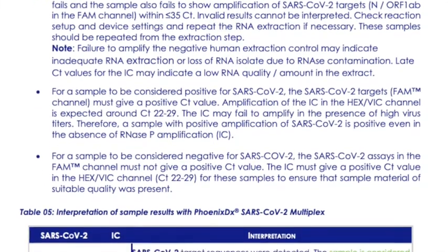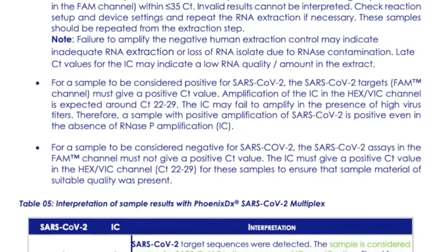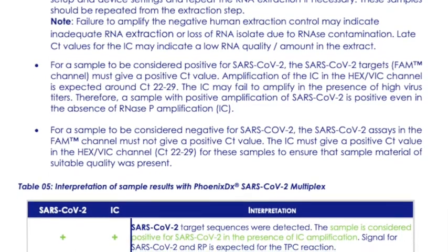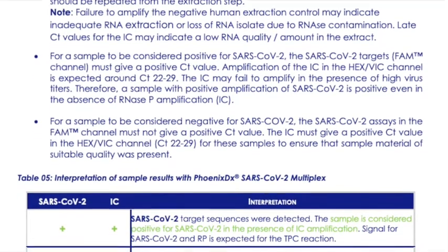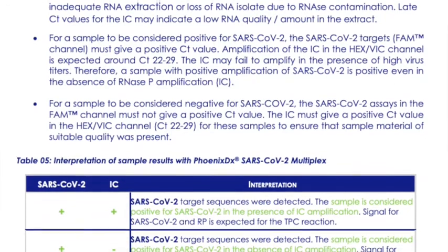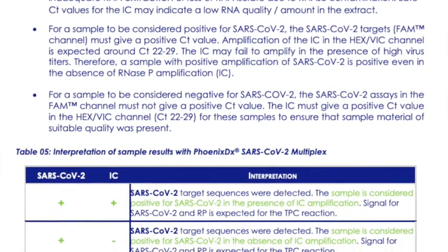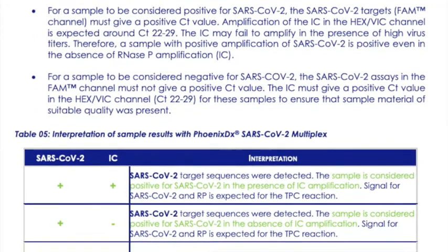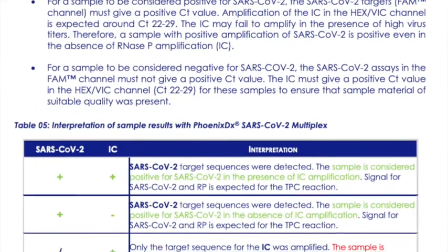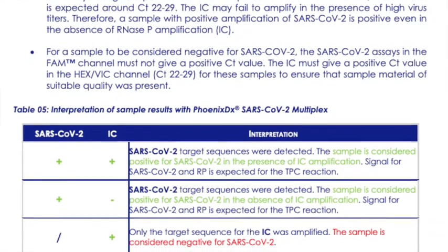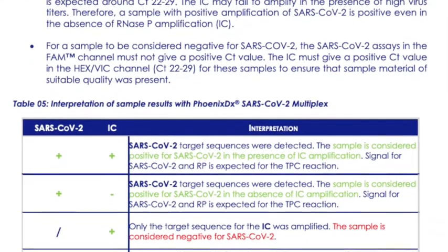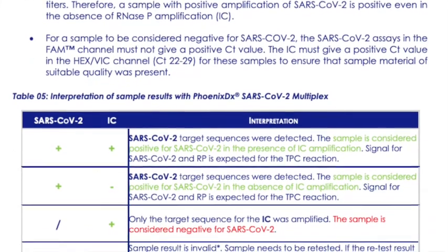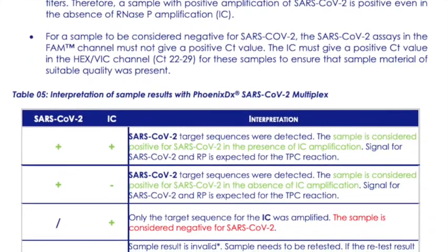As soon as the virus channel shows results even if the internal control, which is the RNase P, shows no results and the VIC signal is absent, then the sample should be still considered positive. However, the sample should be repeated to ensure the extraction worked properly.